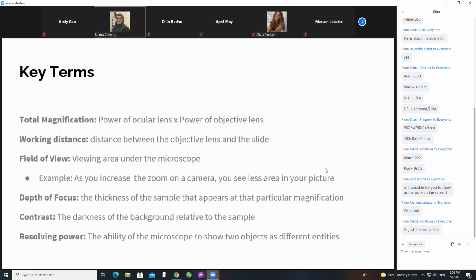So in microbiology lab, staining is a big part of the technique. We're going to talk about it next, I believe on Tuesday or Wednesday. But it's going to give it that contrast. So we're going to use dyes that will adhere to the cells, make them colorful so that the object stands out against a bright background.